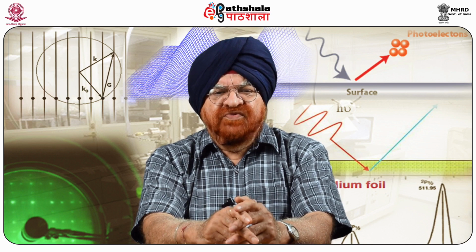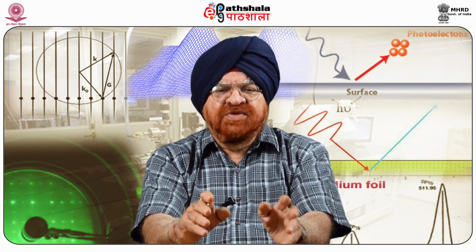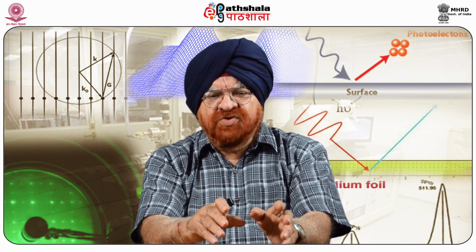Hysteresis in the force between tip and the sample is observed when the tip is withdrawn from the sample. The finite force necessary to pull the tip off the sample surface corresponds to the adhesive force between functional groups on the surfaces of the tip and the sample.